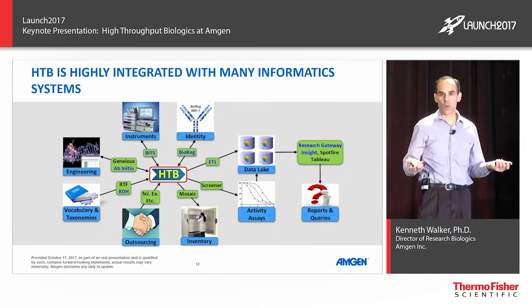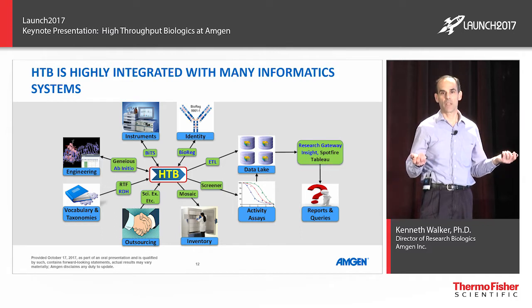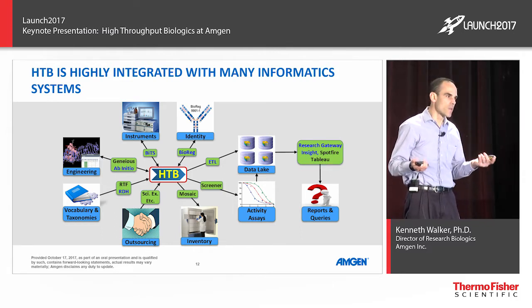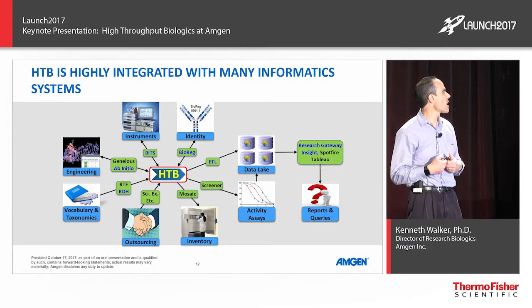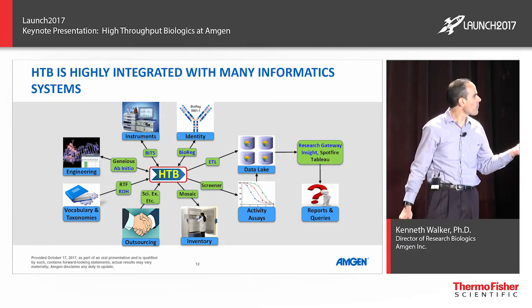We also have to have a way of maintaining our inventory, so we use Mosaic for that. So the materials that we're producing are then logged and registered in their containers, and those then go into our inventory system, and that way it's very easy to order up materials. We have a centralized materials management system for that. Users can also have their own personal inventories too, so we have two separate systems for that, personal inventory and then centralized inventory.